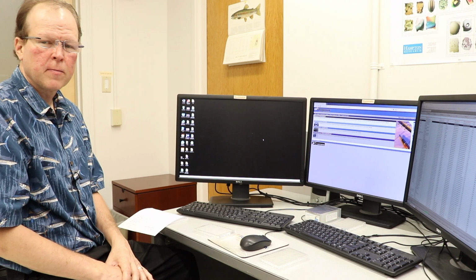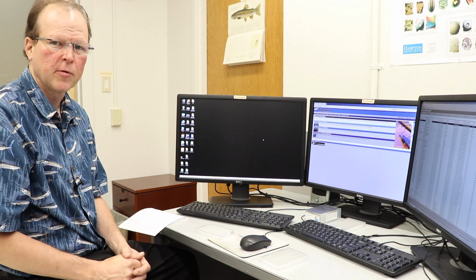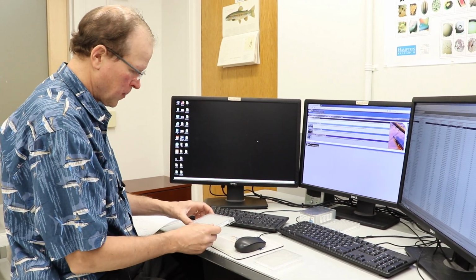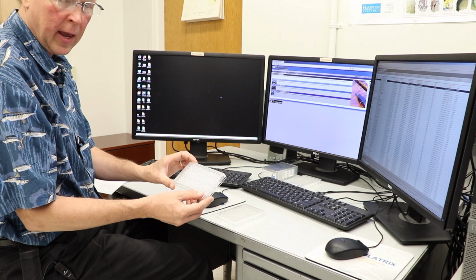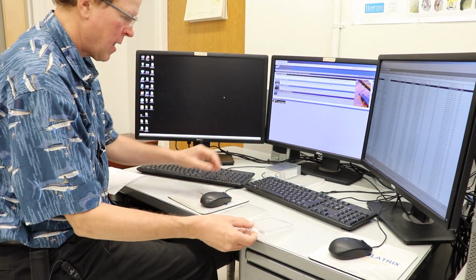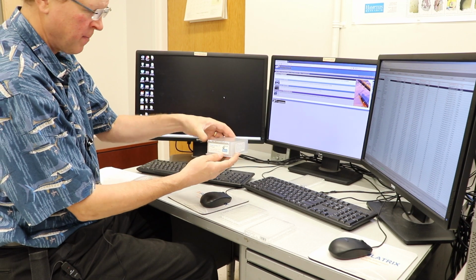Okay, in this section, we will demonstrate how to set up a sitting drop experiment to be imaged in the RockImager 1000. So today we're going to look at using a Corning 3553 standard sitting drop plate and set up 3 drops per well. And we'll have used the screen, Crystal Screen HT from Hampton.